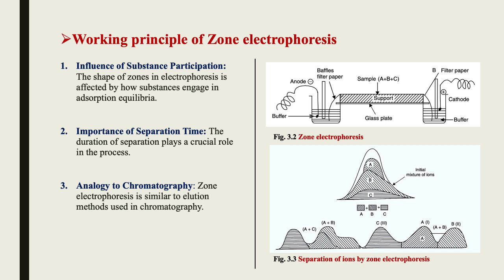Third point is analogy to chromatography. Zone electrophoresis is similar to the elution method used in chromatography, where for separation we use the elution method. So this is similar to the elution chromatographic technique.